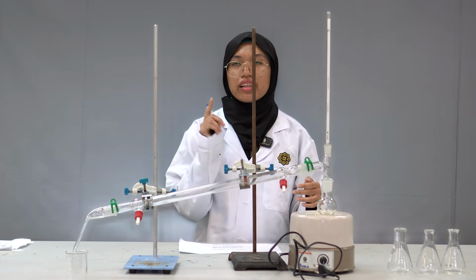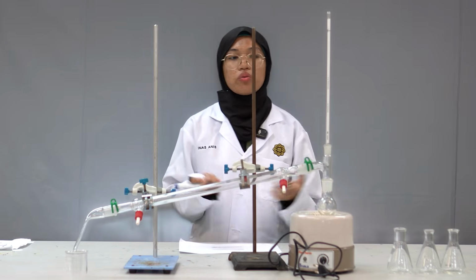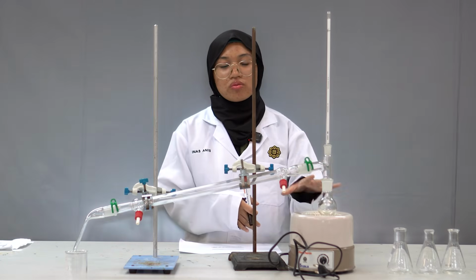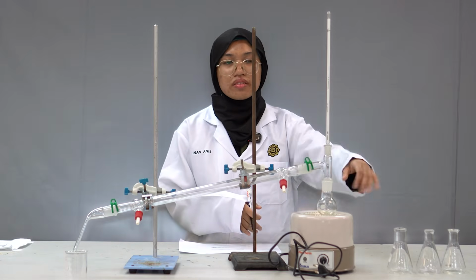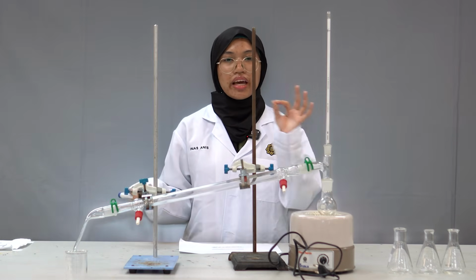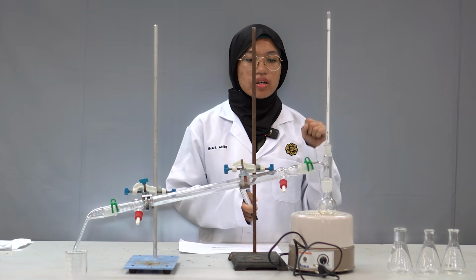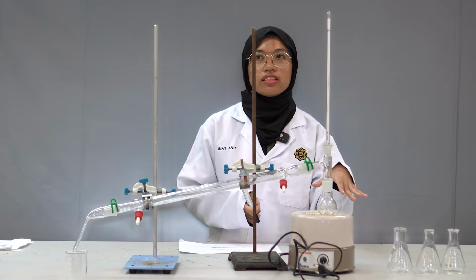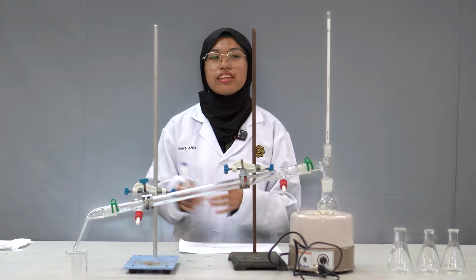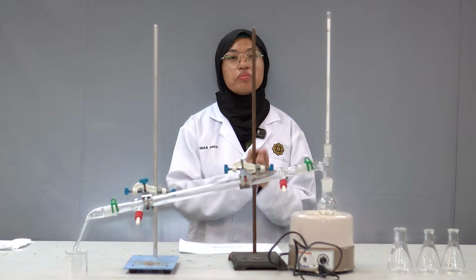We will add anhydrous sodium sulfate, which will absorb any excess water so that we don't have any water left. We also added anti-bumping pellets or granules so that our mixture doesn't splash uncontrollably when it gets superheated.